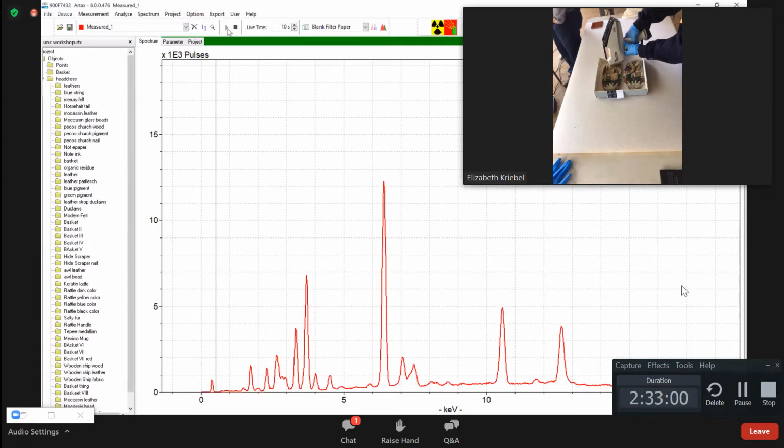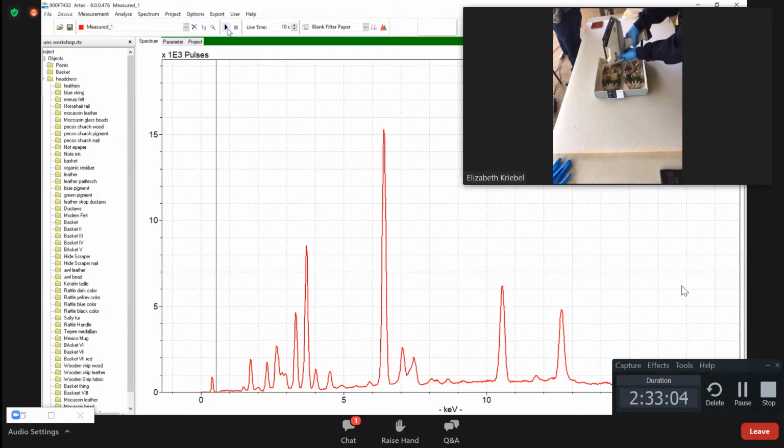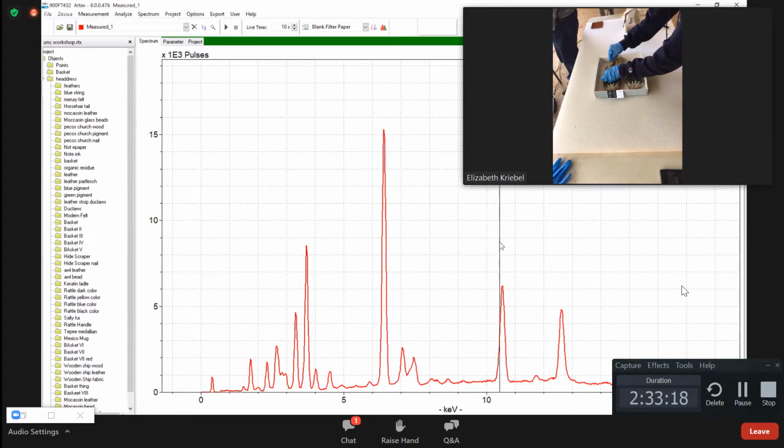And this, Marion, if you're ready for the object number, 73.1.1. Anastasios is still logged in as a participant. Okay, cool. Can you flip the leather over here? Is there anything underneath there? Oh, some ink. Because there's a lot of something on this. Okay, interesting. Yeah, lead. This has got a lot of lead on it. Do you think it's from...? A little bit of arsenic too.